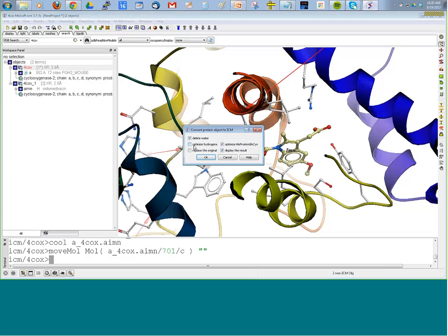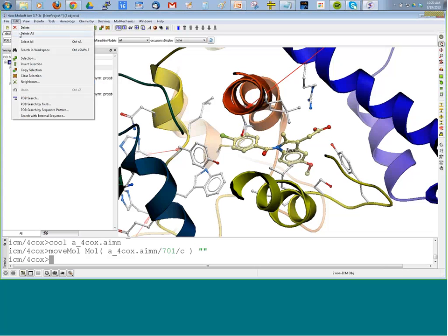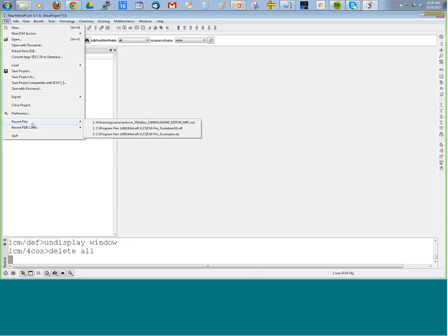If you've added hydrogens, or this process will add hydrogens, we need to optimize the ideal hydrogen bonding network in the pocket. We also need to optimize asparagines and glutamines where the orientation of the side chain is unclear from the density. And the same with histidines, we will optimize the hydrogen bonding for those. So you select those parameters, and depending on the size, this may take a few minutes to run the conversion. I have an already pre-converted version.